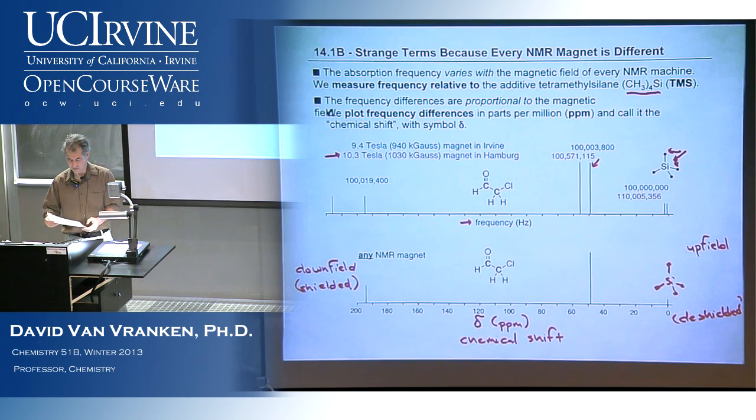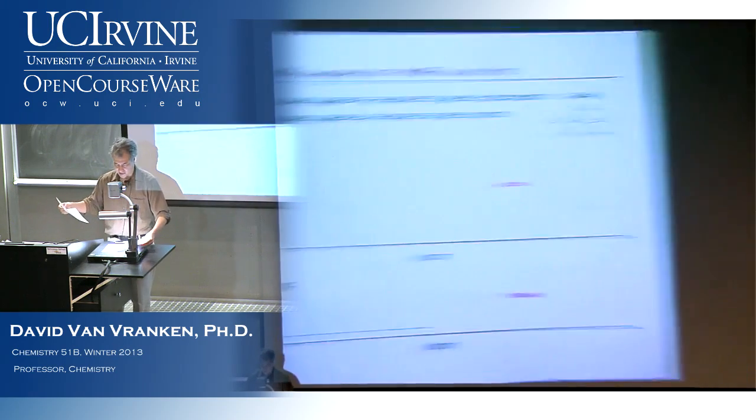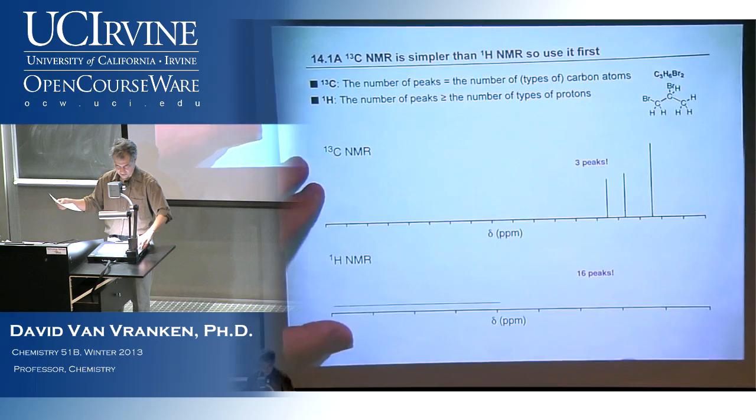So I'll try to avoid the phrases downfield and upfield because I know they're so counterintuitive, but if I slip, you're going to have to quickly process in your mind what that means.